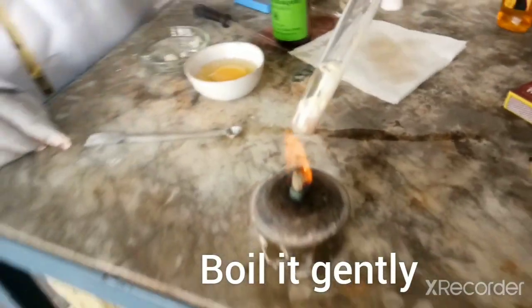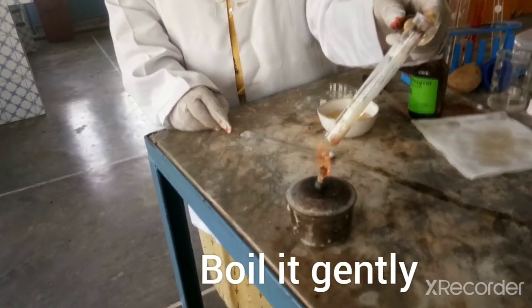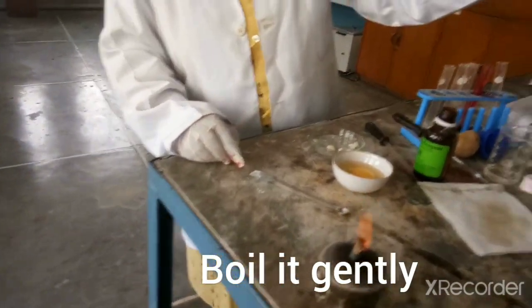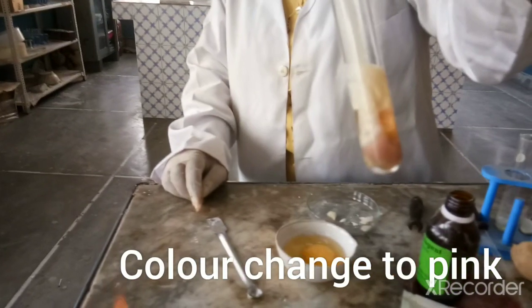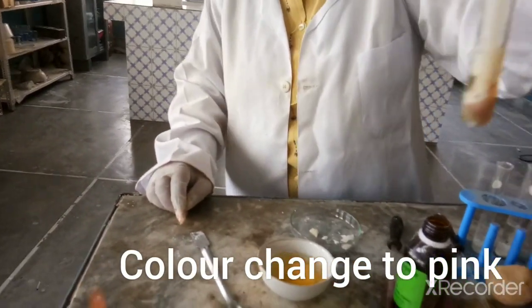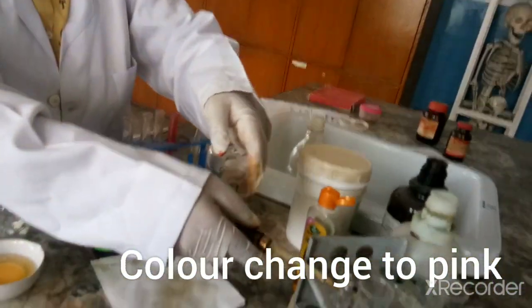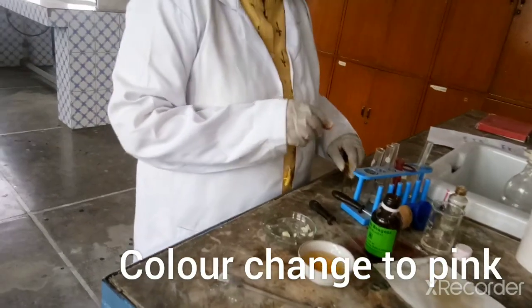Be careful while you are boiling. Now you can notice it is pink in color. I will keep it aside for the time being so we can observe the change in color later on as well.